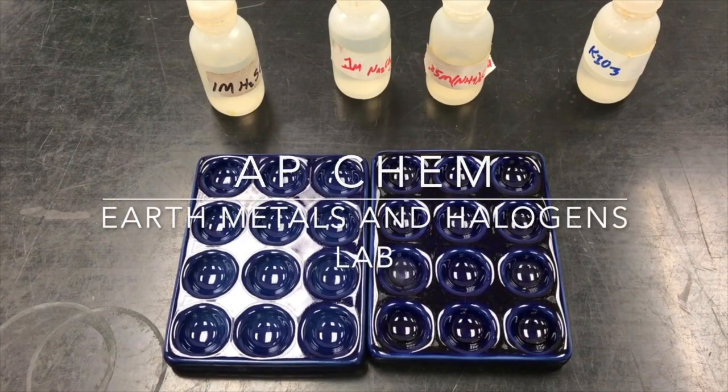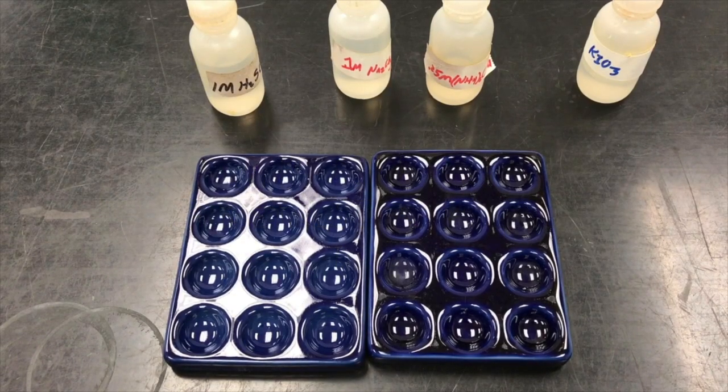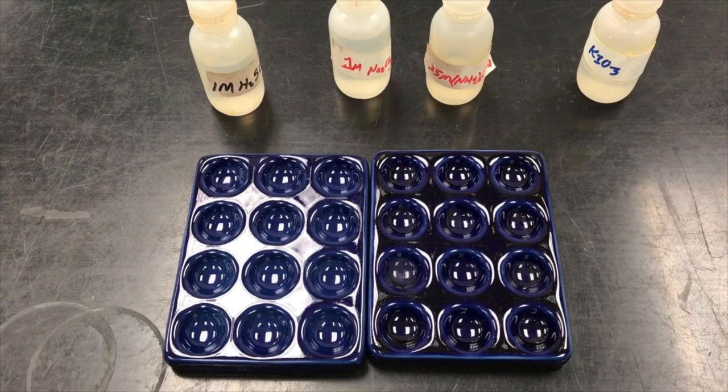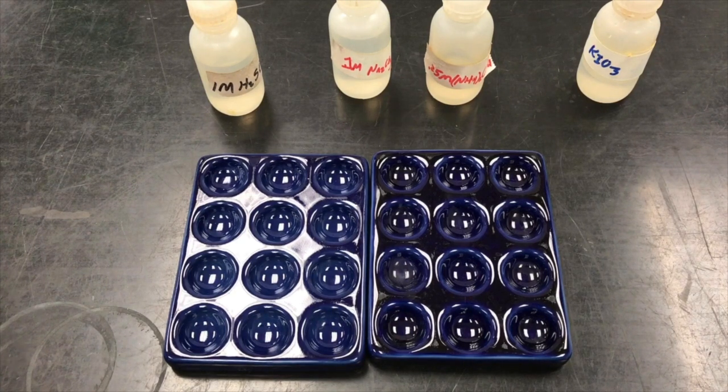In part A of this alkaline earth metals lab, we are going to observe some solubility patterns.